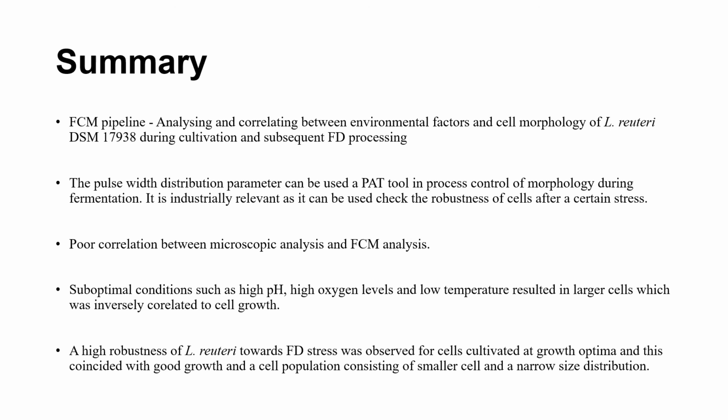We also saw that there was poor correlation between microscopic analysis and flow cytometry analysis for morphology, which suggests that the flow cytometry analysis gives more information than just the cell size.